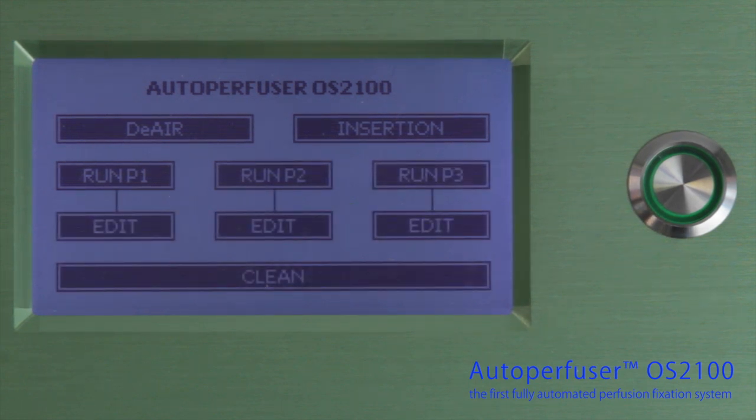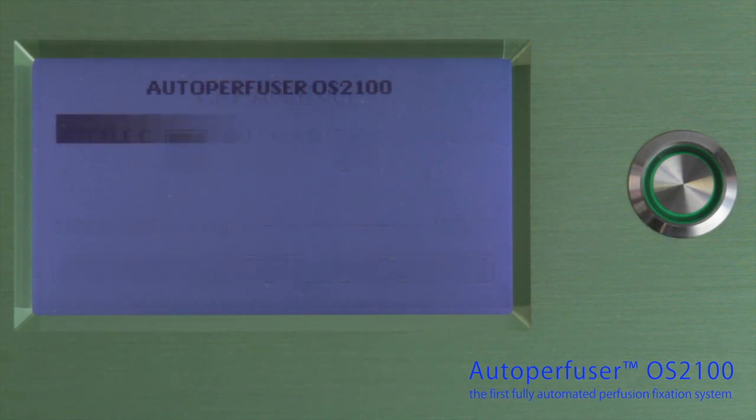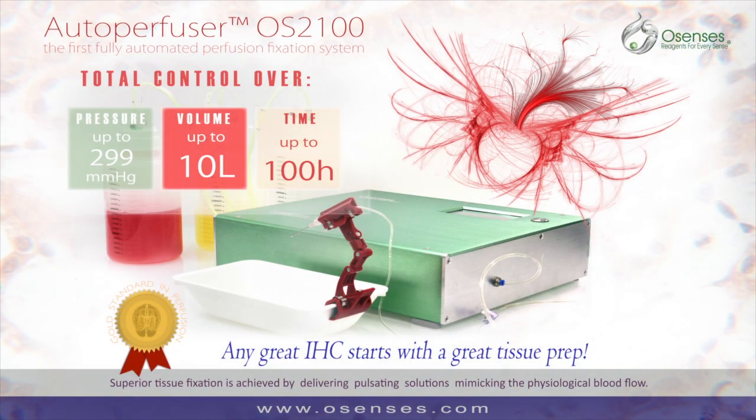The Autoperfuser runs a self-cleaning program. Press clean to automatically purge the tubing with the cleaning solution. Easy, time-saving, perfect perfusions. The Osensis Autoperfuser fixes the tissues — naturally.